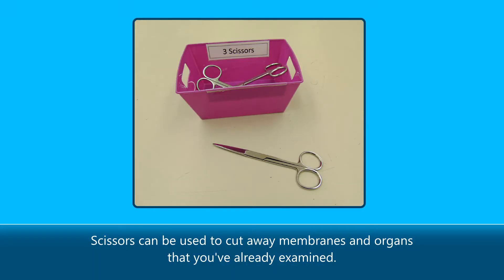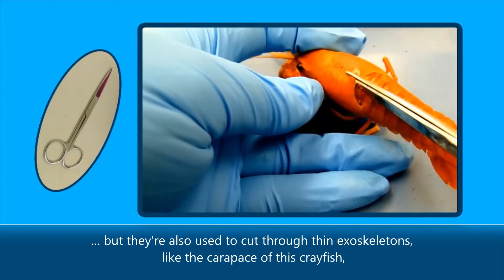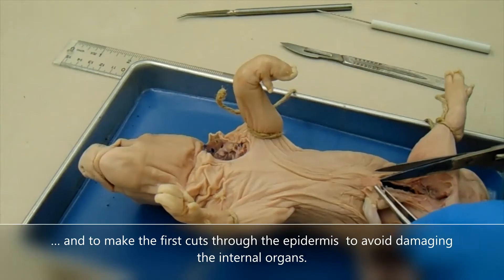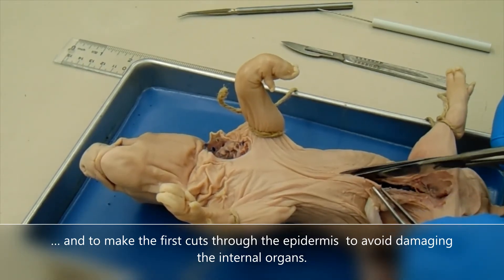Scissors can be used to cut away membranes and organs that you've already examined. But they're also used to cut through thin exoskeletons, like the carapace of this crayfish, and to make the first cuts through the epidermis to avoid damaging the internal organs.